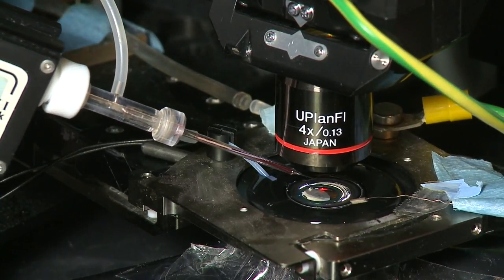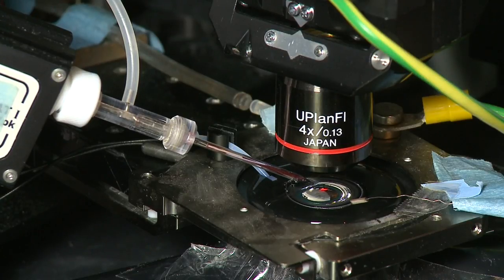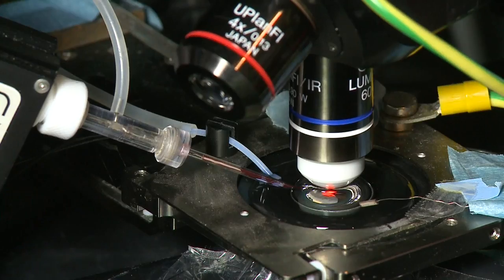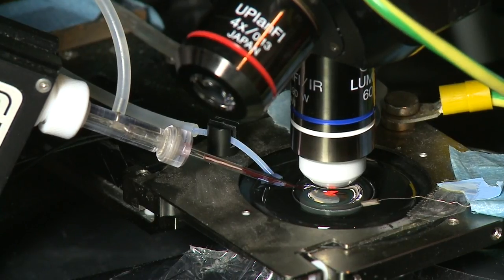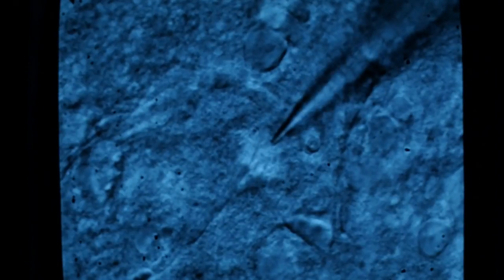First, we find our pipette under low magnification and then switch to the higher magnification we were using to visualize the cells. It is important to move the pipette with great care, making sure not to damage the brain slice. We bring the pipette down towards the brain slice, near the location of the neuron we would like to record. When the pipette touches the brain slice surface, we can see the tissue getting pushed away from the tip. That is because of the positive pressure around 15 millibars we apply to the inside of the pipette, causing an outward flow from the pipette tip.